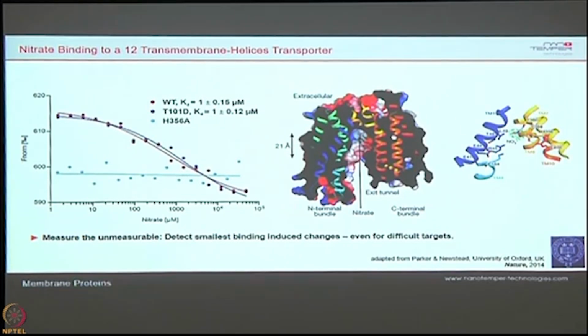So here in this technique, as I said, we are using only 3 to 4 microliters of the sample, so that thing can be nullified. So even membrane proteins can successfully be studied here. As you can see, the paper again hit the Nature, where the membrane bound protein has been expressed with the GFP, and that particular protein has been studied for the microscale thermophoresis.